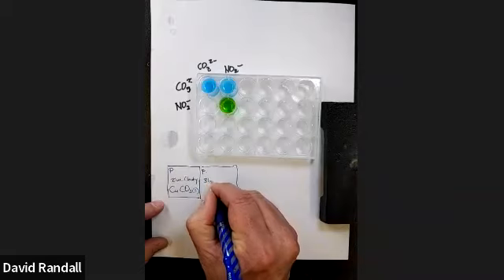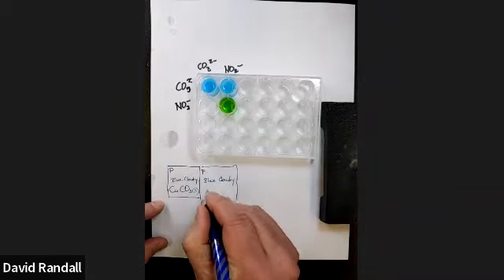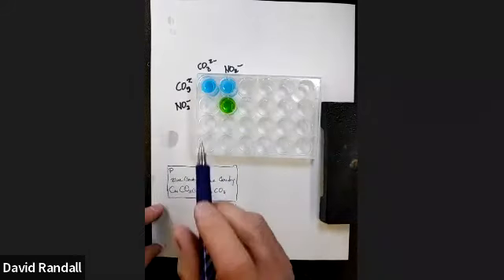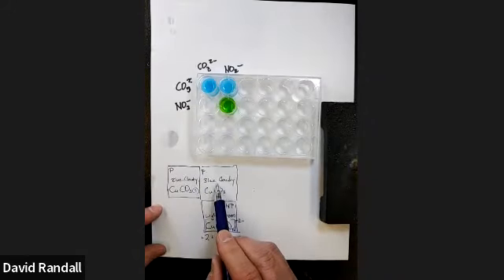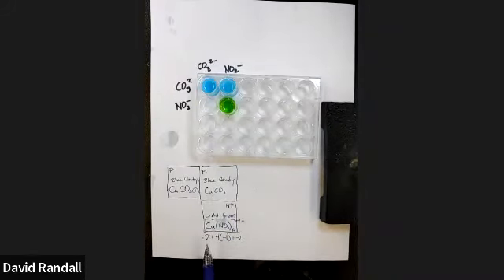It's kind of blue cloudy, C-L-O-U-D-Y, and it's copper carbonate. So basically the only choice for this well here is this one or this one. So the off diagonal one has to match the two possible diagonals. Okay, so my claim was the order that we added it didn't matter. And that's definitely a true statement, but let's go prove it to ourselves.